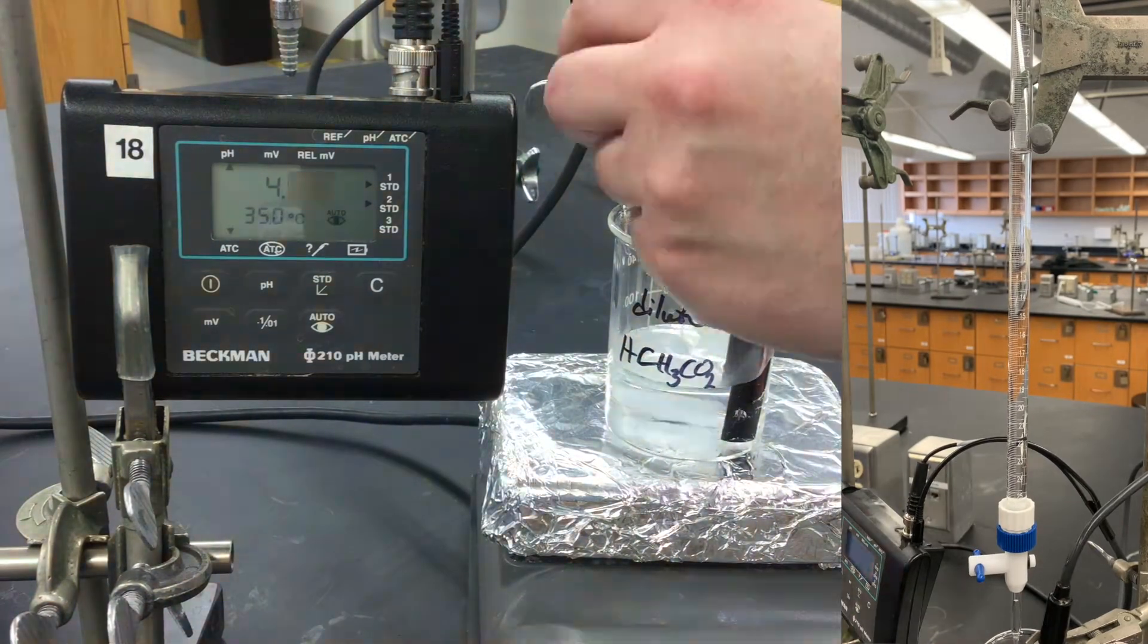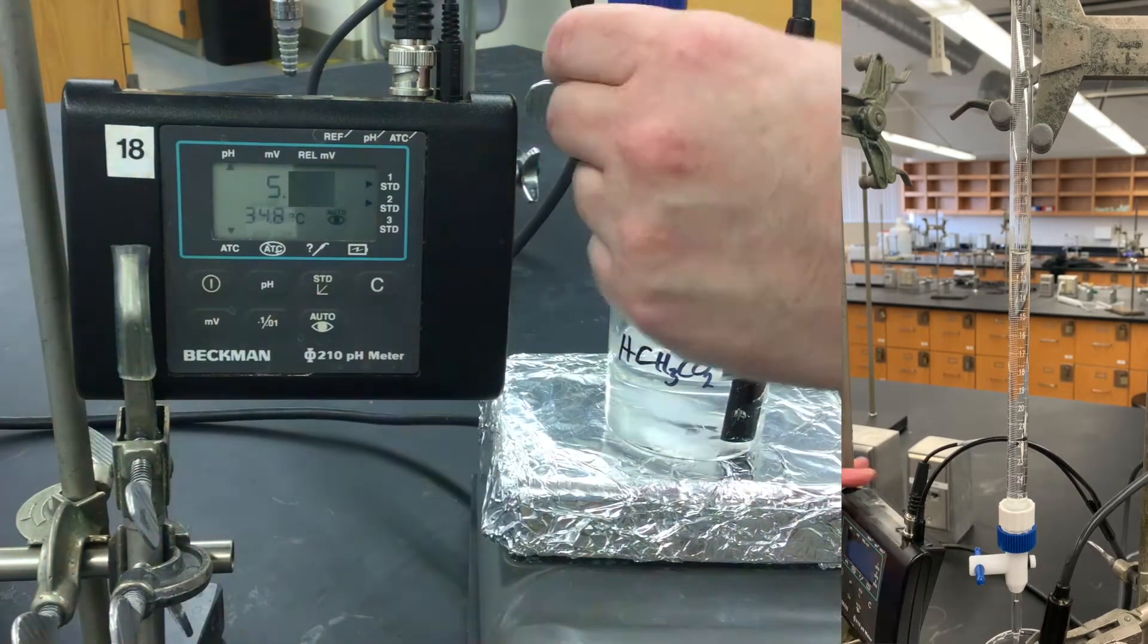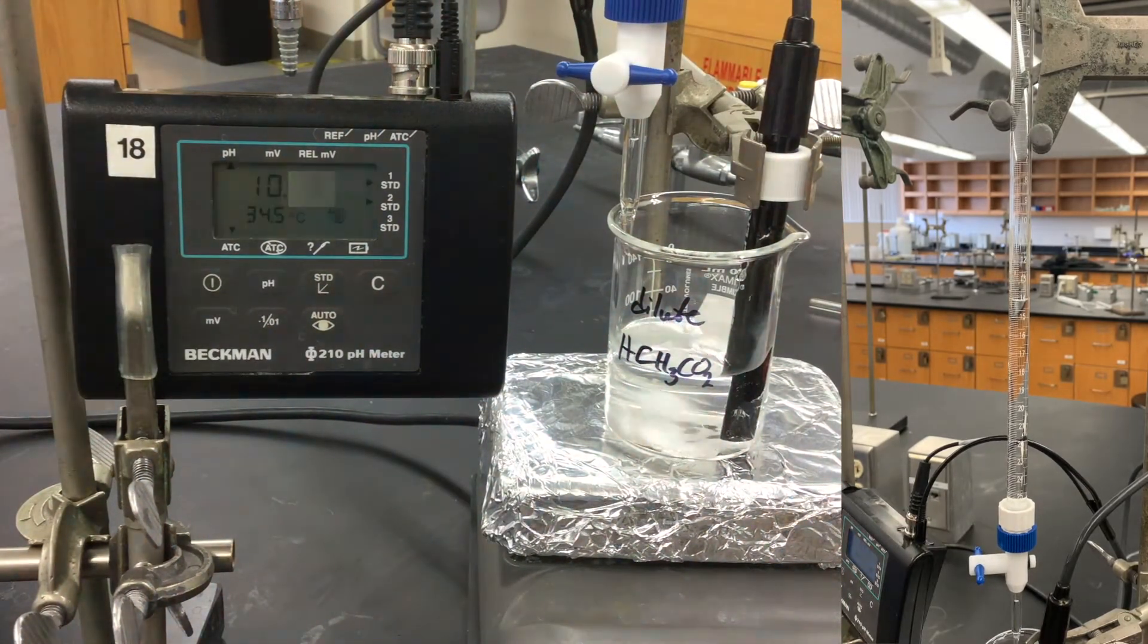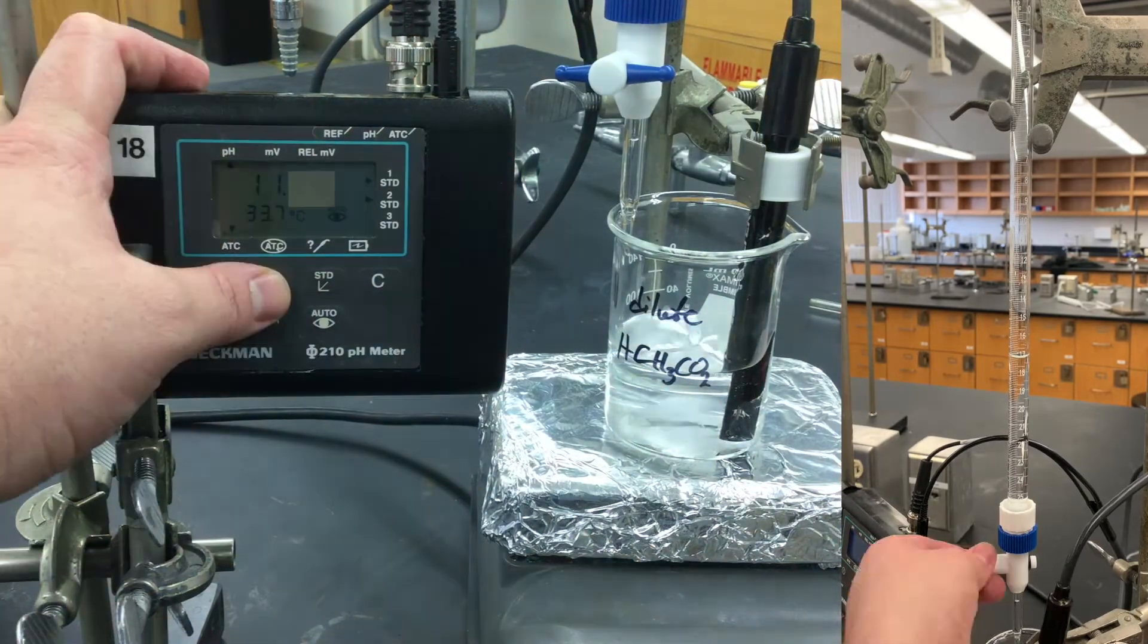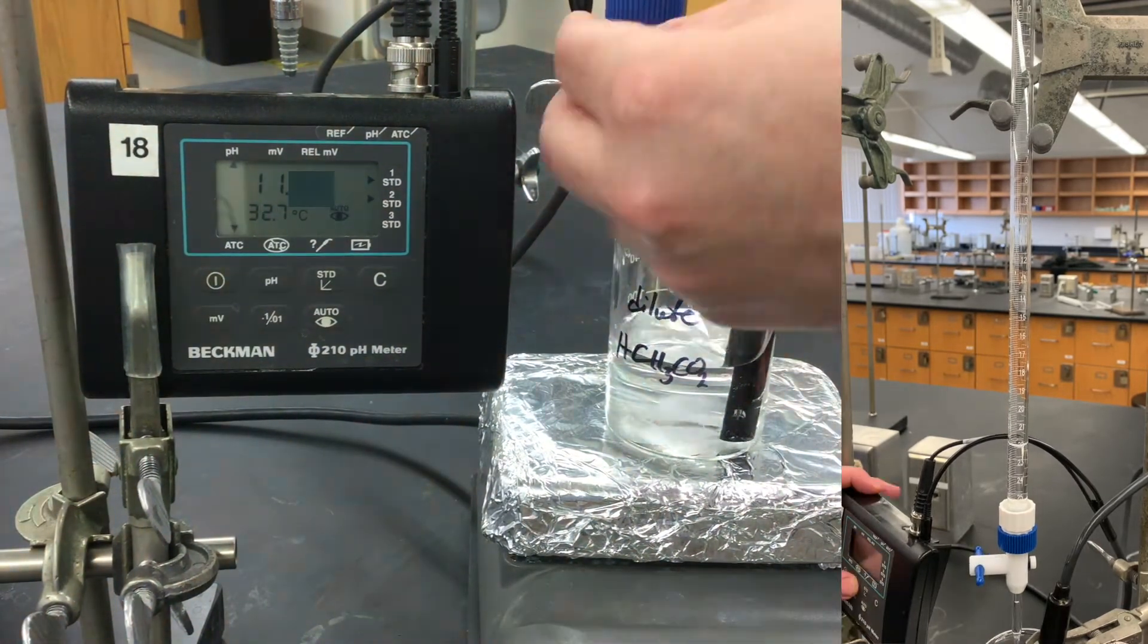So now we're going to go through and add half a ml of sodium hydroxide at a time. Between each one, clicking pH, waiting for the reading to finish. That eye will stop blinking when the reading is finished. And we will go through that until we've gone through the entire burette.